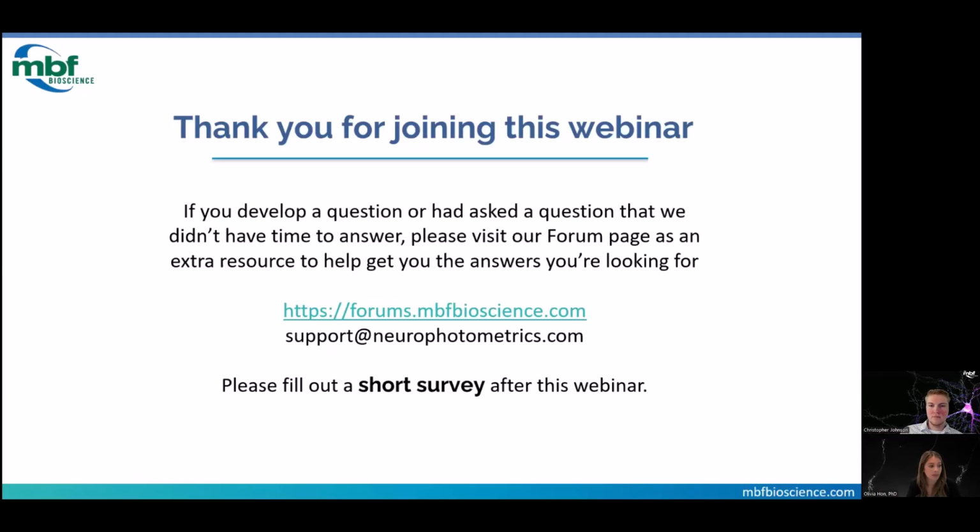Very cool. Any other questions? We got a couple minutes. I guess on the optostim, how flexible is your ability to control the various parameters of optostim? Can you dynamically control power, frequency, pulse width?